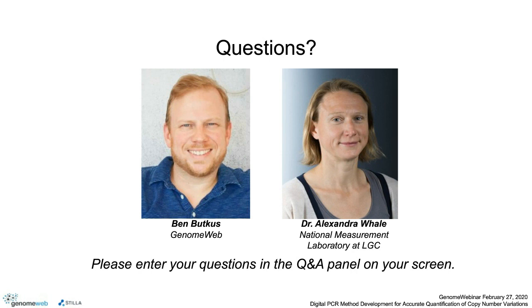Thank you. The next question. Would you consider the method you described today quantitative or qualitative in terms of CLSI guidelines? Having thrown a lot of acronyms out, CLSI is what? Can I come back to that question? My colleague is just going to quickly check. Yes, it's Clinical and Laboratory Standards Institute. Okay, sure.